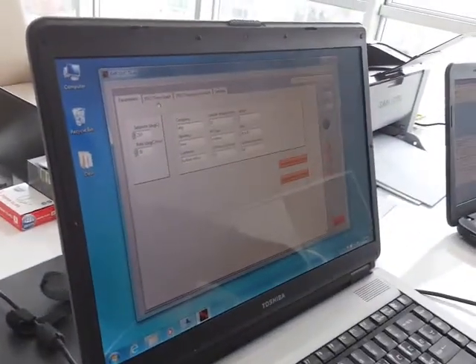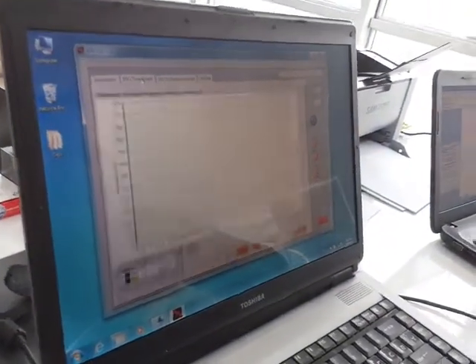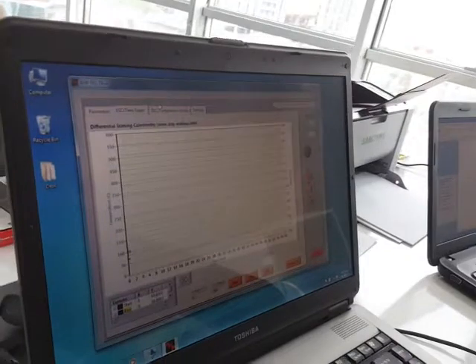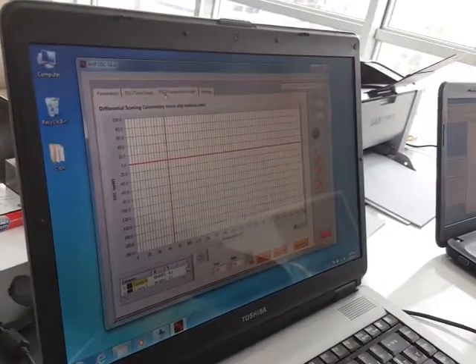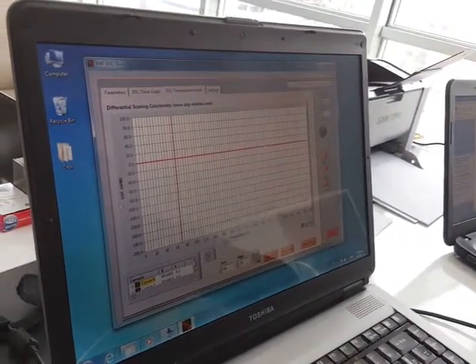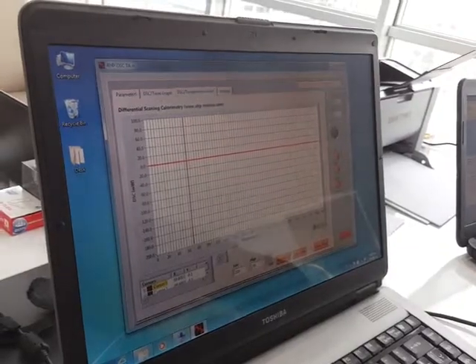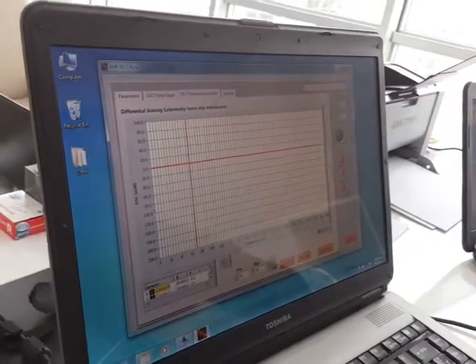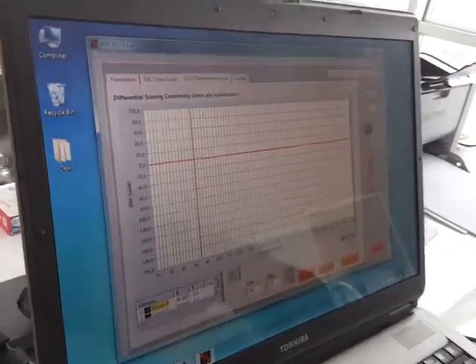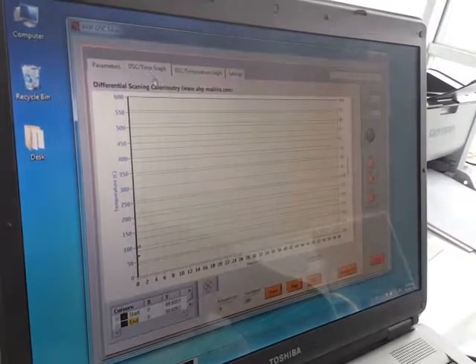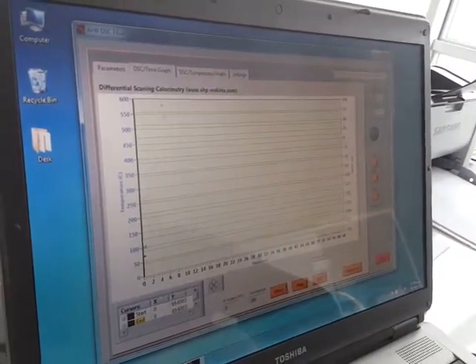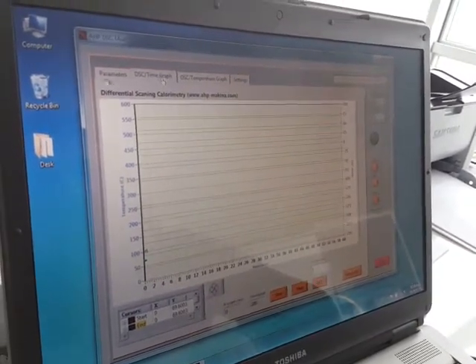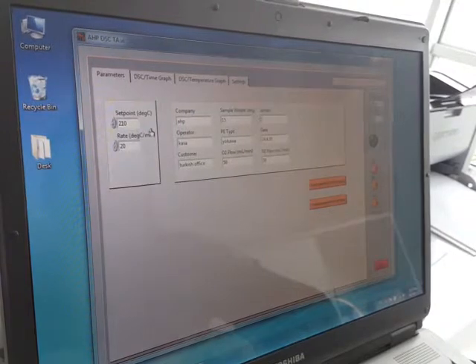The AHP DSC TA basic software includes capability of measuring oxidation induction time. You have the DSC temperature versus temperature graph here, and you have the DSC time graph.